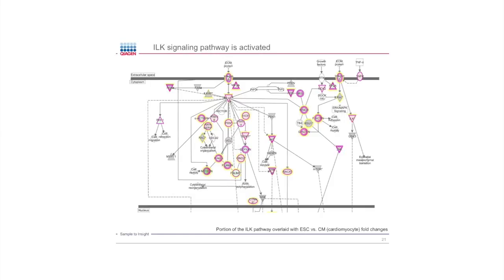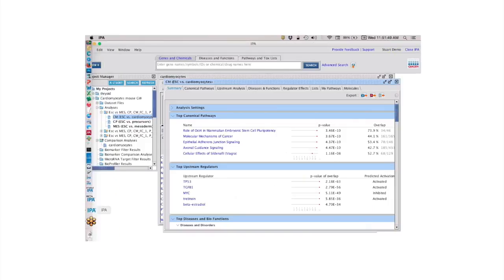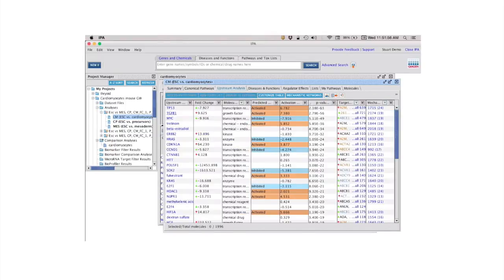Is isoform view available for human genes? Yeah, absolutely. Let me go quickly to IPA itself and open a gene, say TGF beta 1. So I'm jumping to a gene view, and I wanted to show you how that looks. By default, if you don't have data and you just come into IPA and look up a gene, the gene view is going to show you the human isoform from RefSeq. So the default state of IPA's gene views is actually human RefSeq.